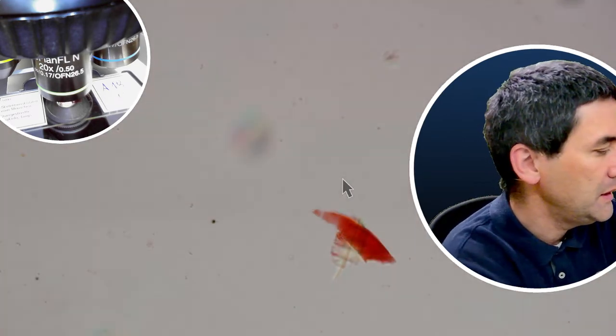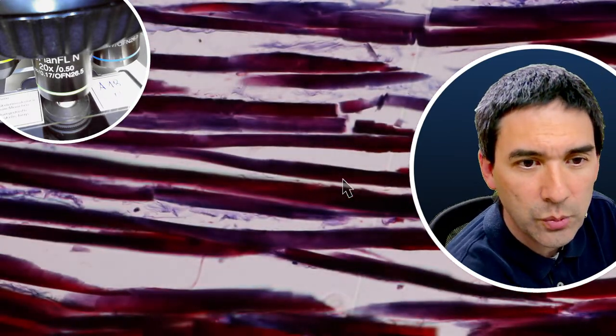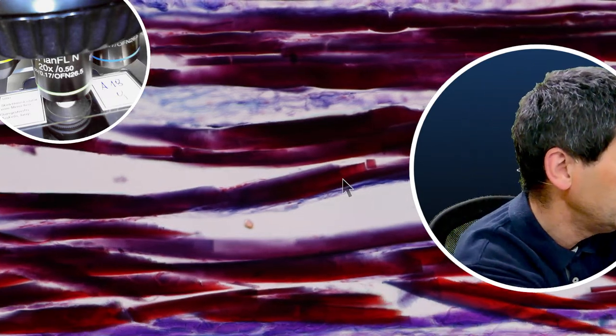So let me have a look here. Yes, and I think skeletal muscle is quite interesting for a variety of reasons. And if you want to observe skeletal muscle yourself, I did make a video some time ago where I put some chicken meat under the microscope.